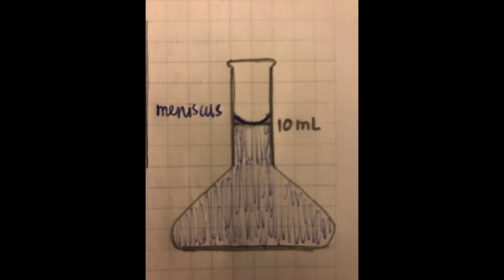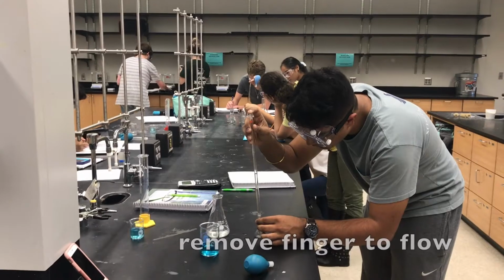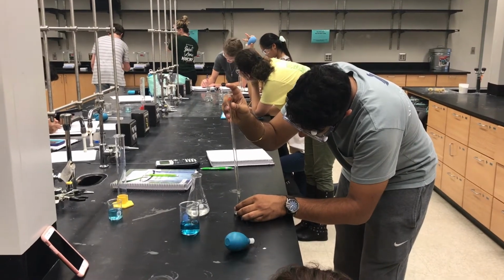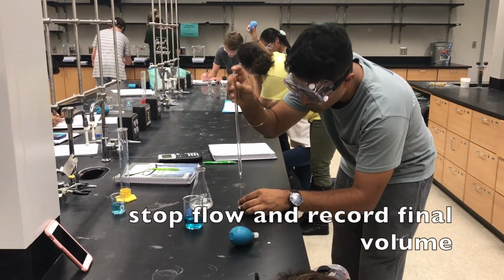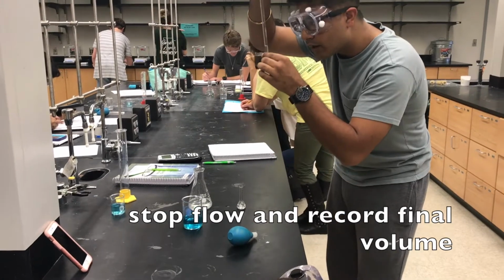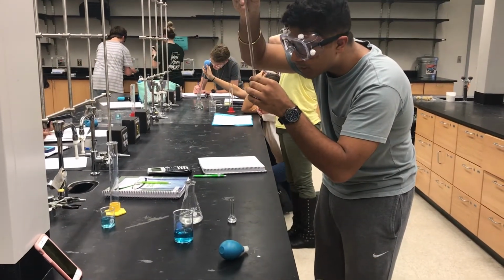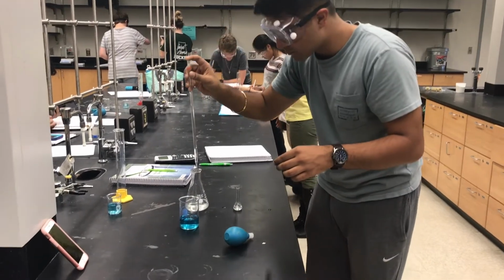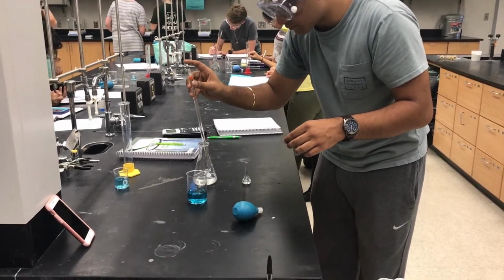Record this number to 1 degree of uncertainty. Next, remove your finger and allow some of the solution to flow into the volumetric flask and cover the top with your finger again to stop the flow. Read and record the final volume in the pipette at eye level. Finally, determine the volume of the solution by taking the final volume minus the initial volume.